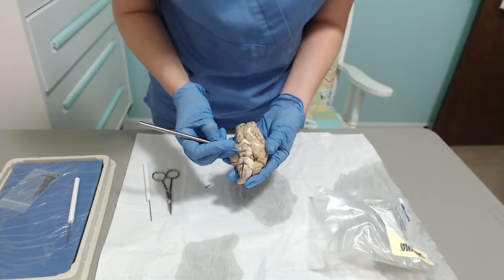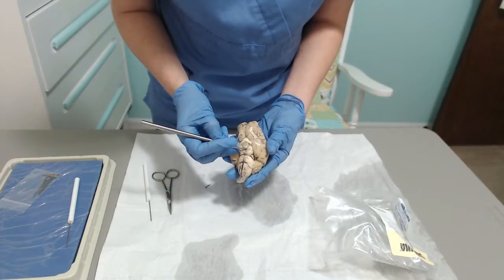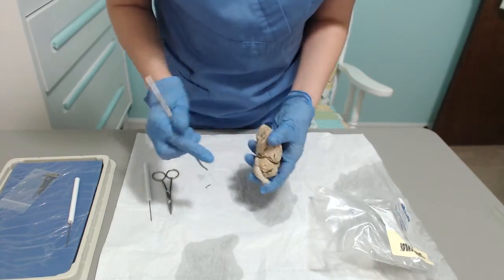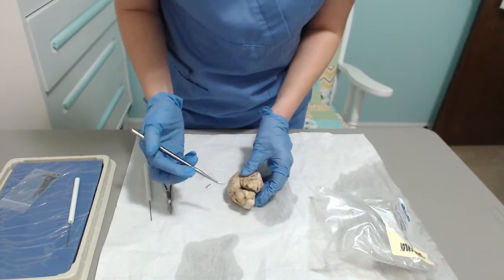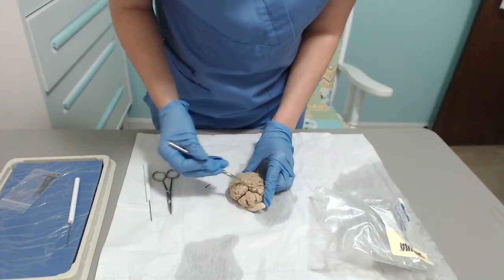And then the mammillary bodies are right here. Usually they look like two cylinders or spheres right below the pituitary gland. Okay, and next we are going to look inside and do a lateral incision. Of course, cerebellum.